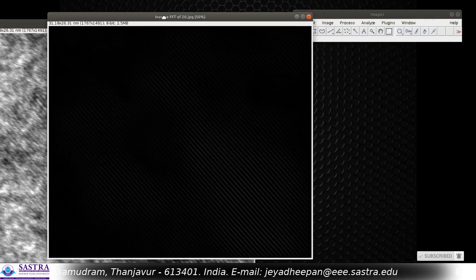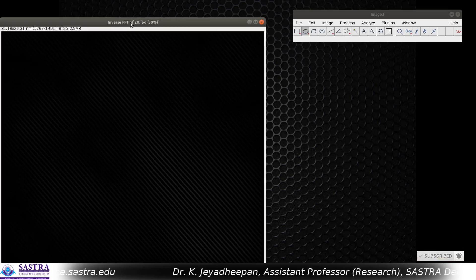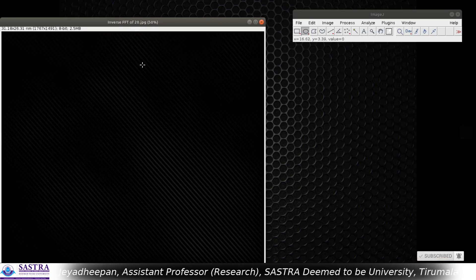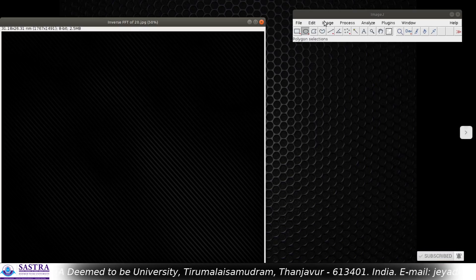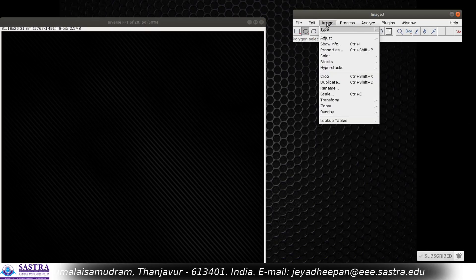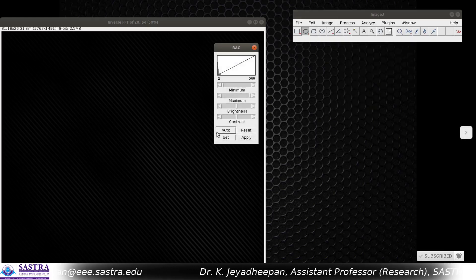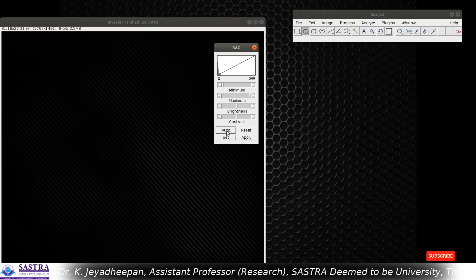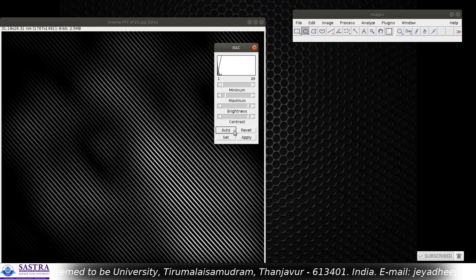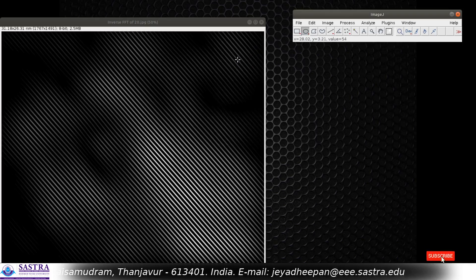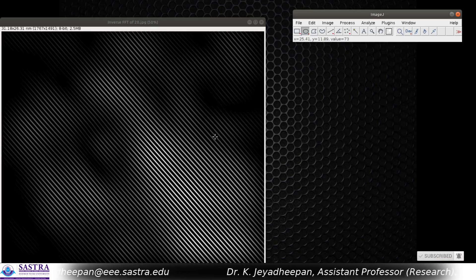Now we are going to measure the lattice fringe width or the D-spacing manually. Before that, we have to correct the brightness and contrast of the image so we can do the analysis easily. Go to Image, then Adjust, then Brightness and Contrast. Simply press Auto — you can see the brightness and contrast is automatically applied. We all know that D-spacing is the perpendicular distance between the lattice planes.